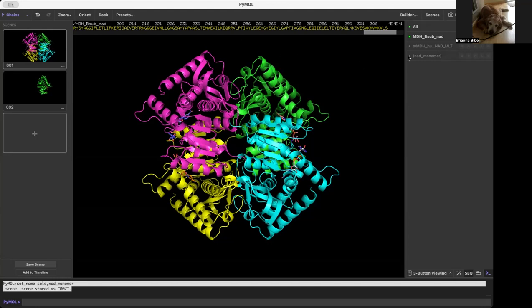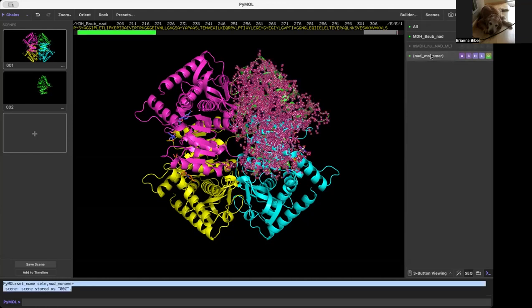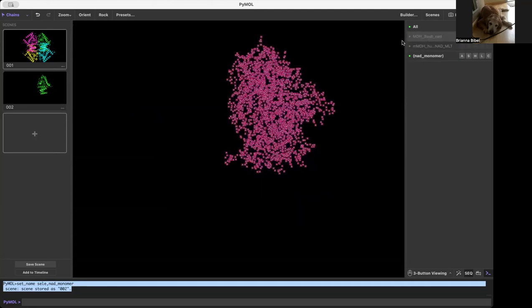Maybe I decide I want to show the monomer again. So I come over here and I click select, I select that object and you can see that'll go to my selection. But if I remove the part that the selection came from, now you'll see it's totally disappeared.